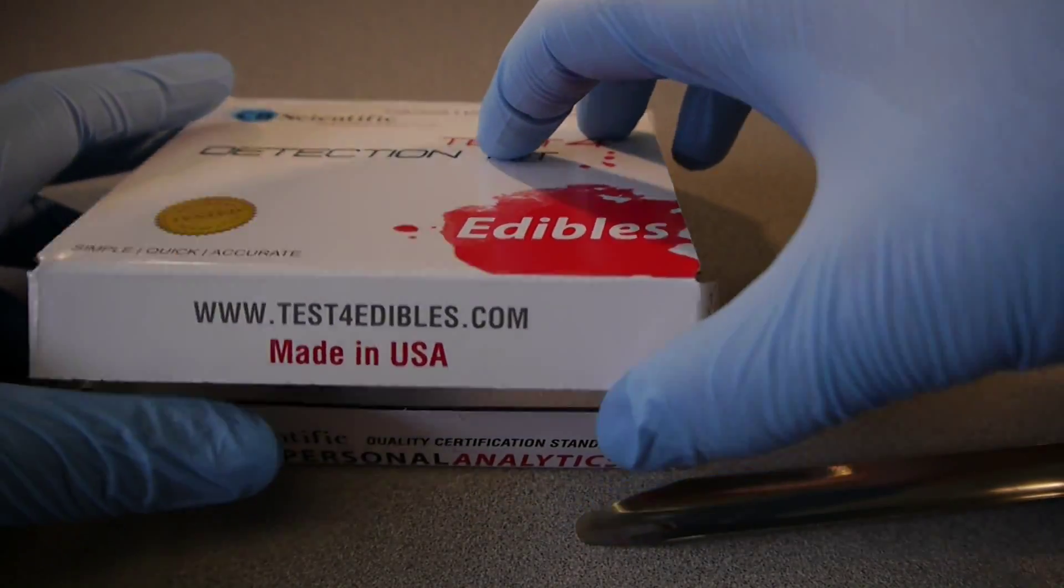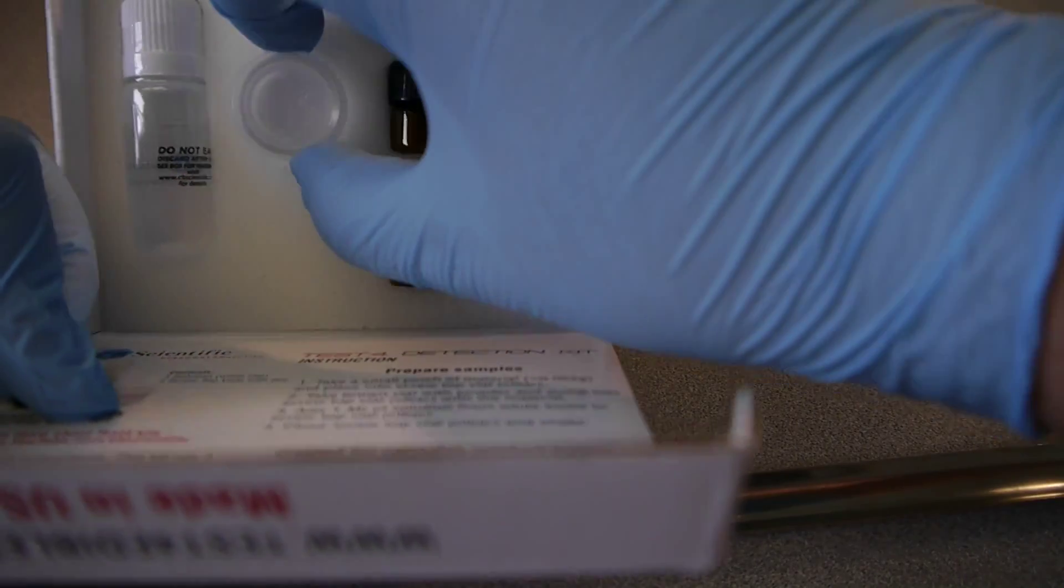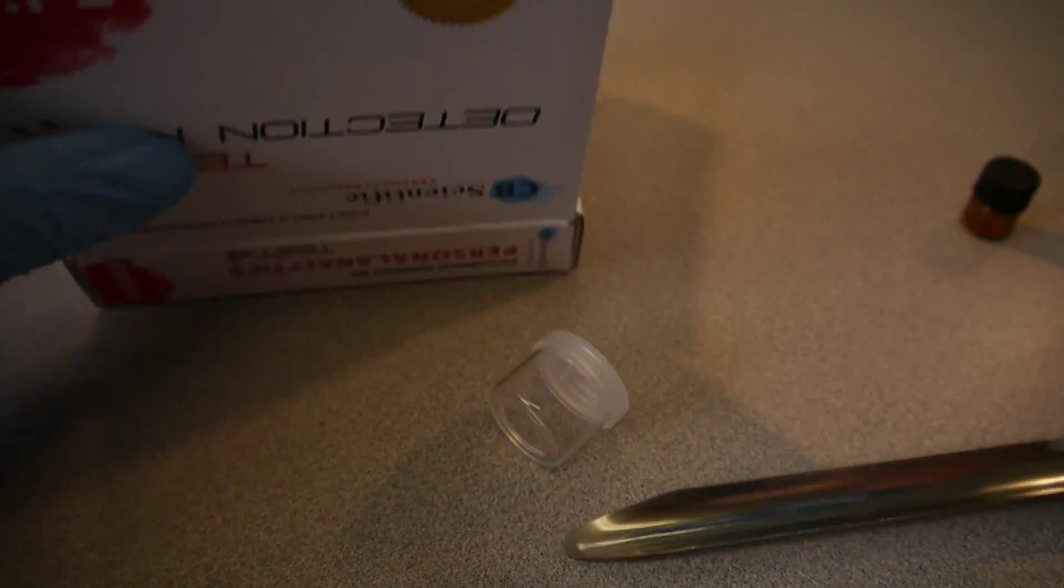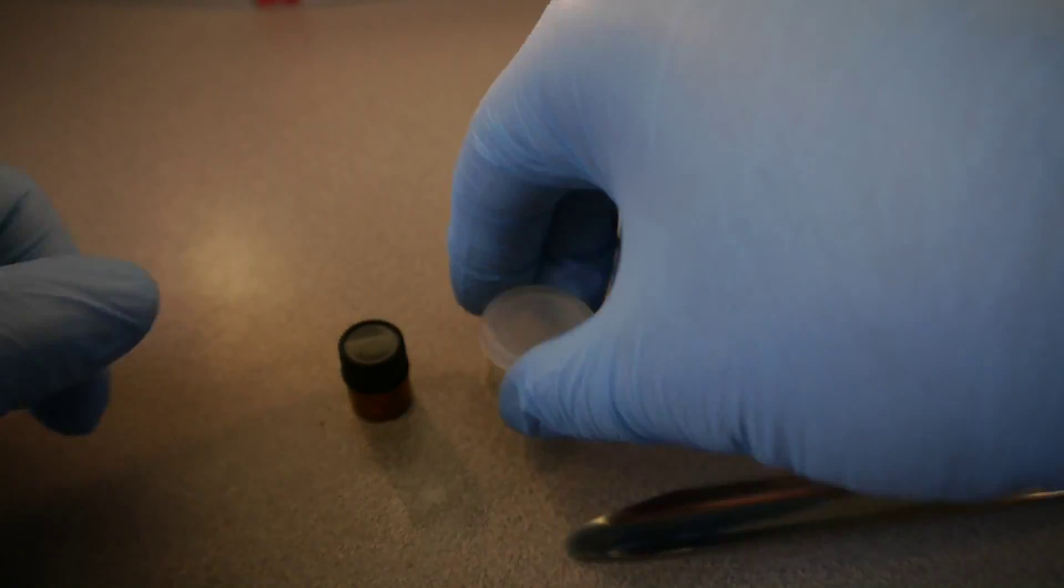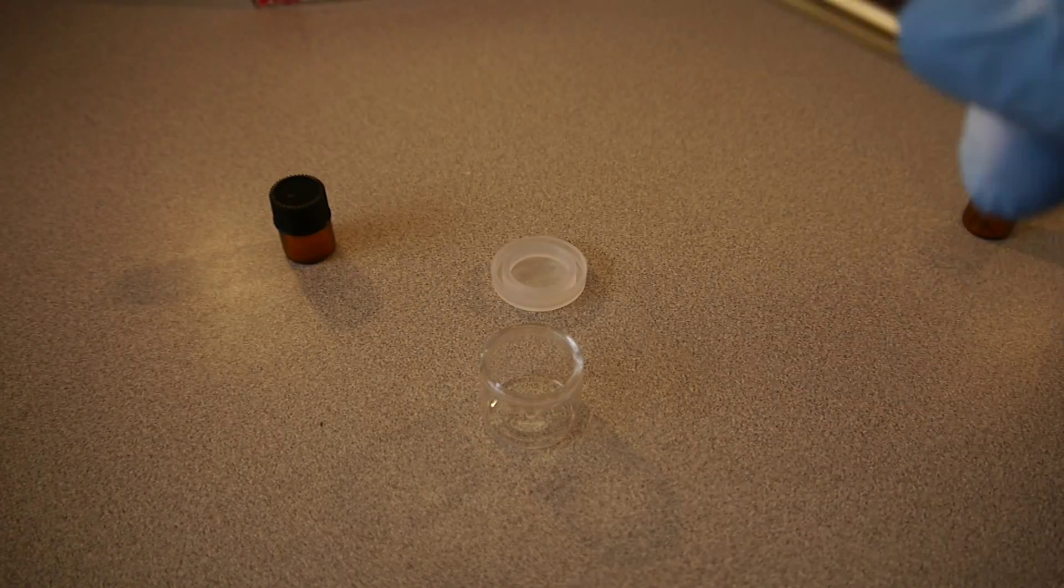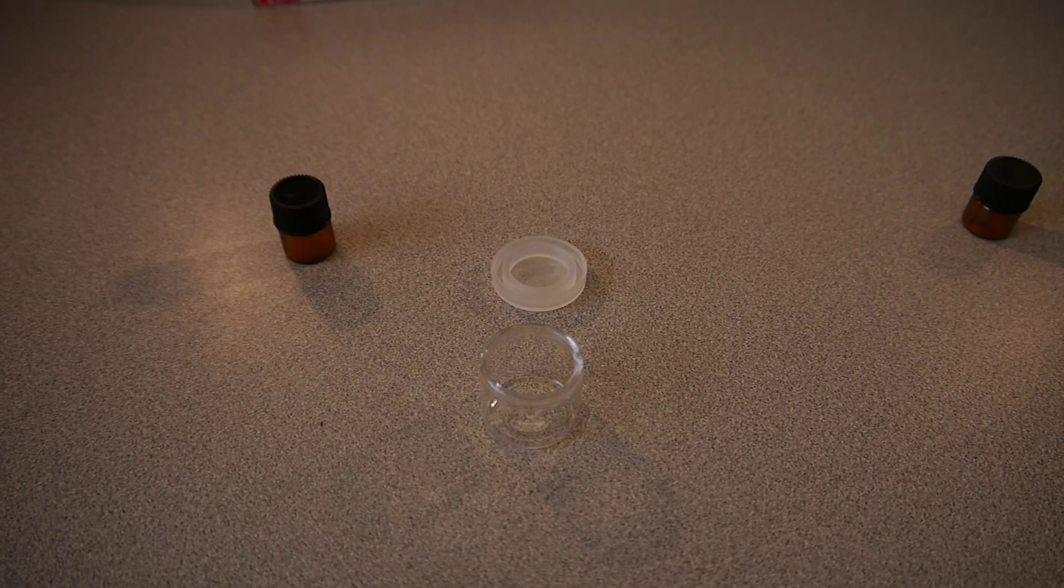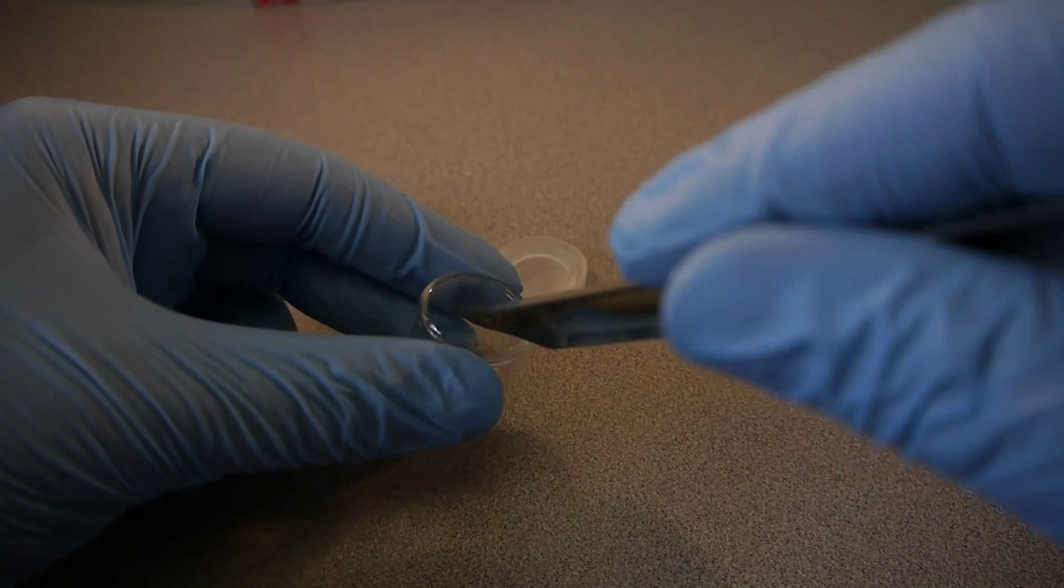And for the edibles detection kit, it works in a similar fashion. We're actually going to be doing that as well. Now, we're going to take out our little reaction vial here and put that down. We're also going to be taking out another bottle or a vial of our dye solution, and we'll open up the reaction vial, put that down, get some more of our material. Again, a very small amount is needed, it's quite necessary, put that inside.